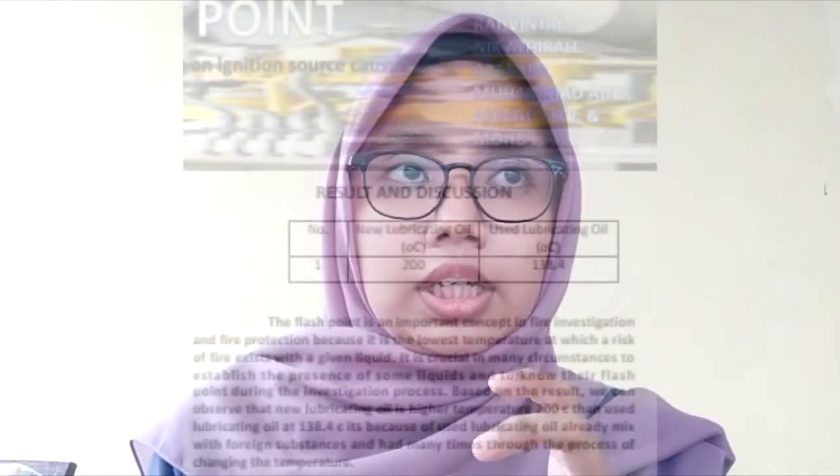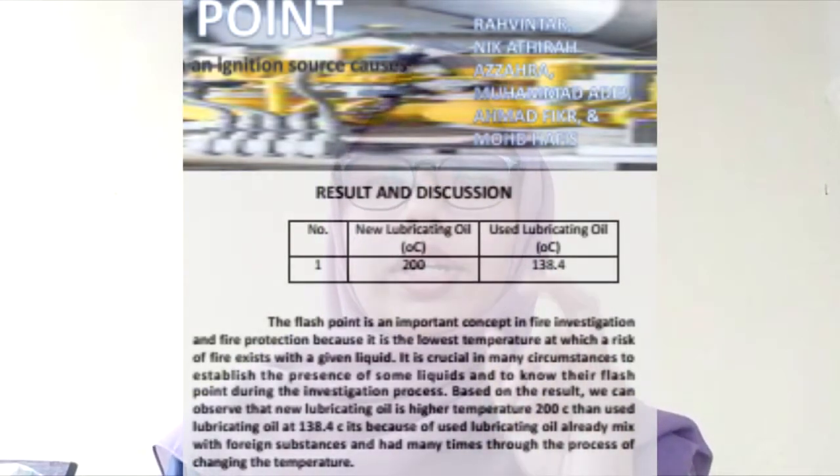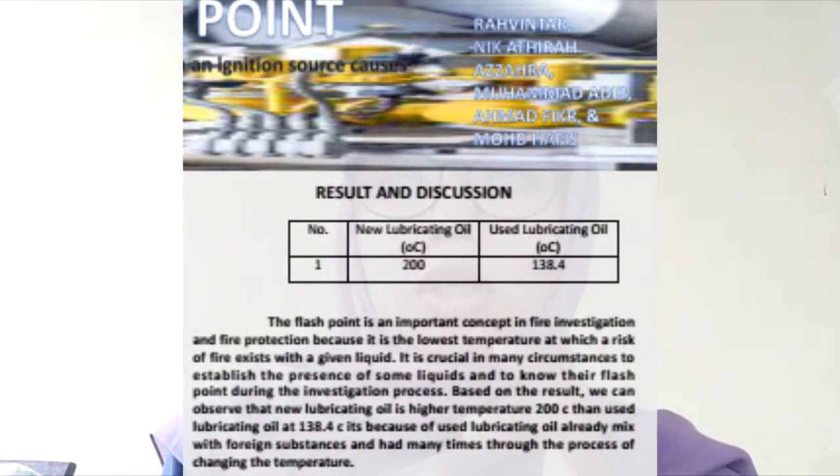Based on the result, we can observe that new lubricating oil has a higher temperature, which is 200 degrees Celsius, than used lubricating oil at 138.4 degrees Celsius.